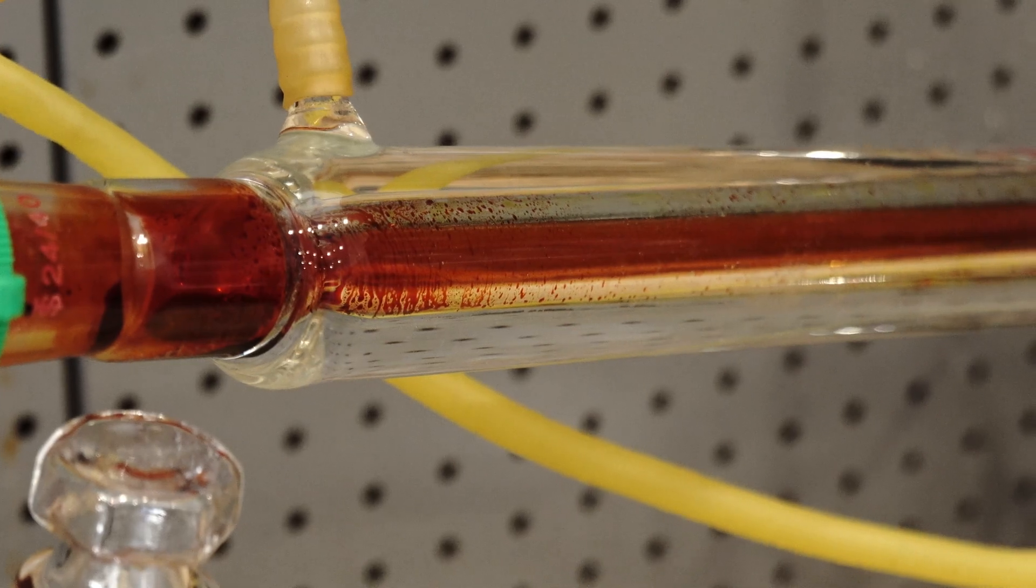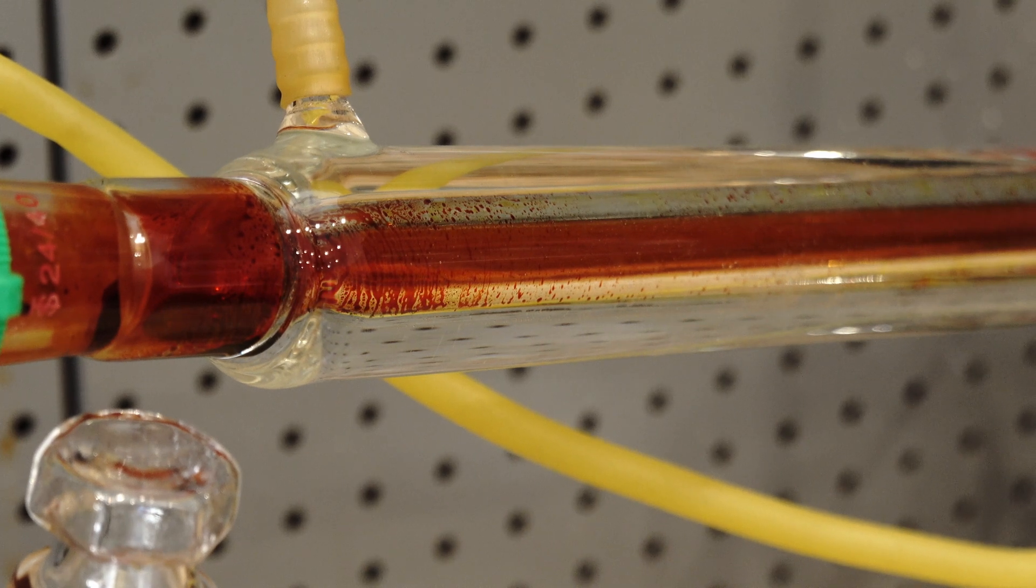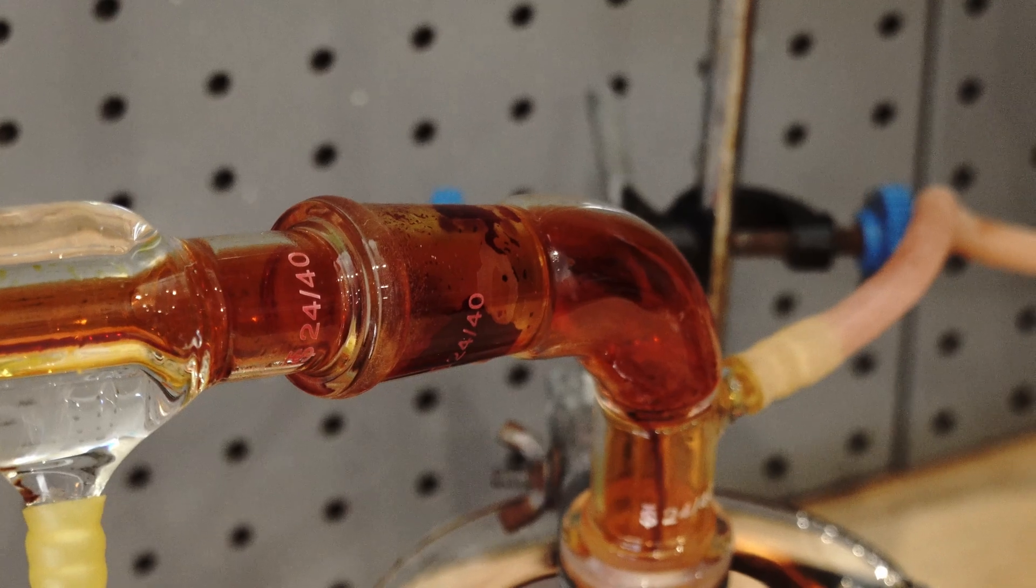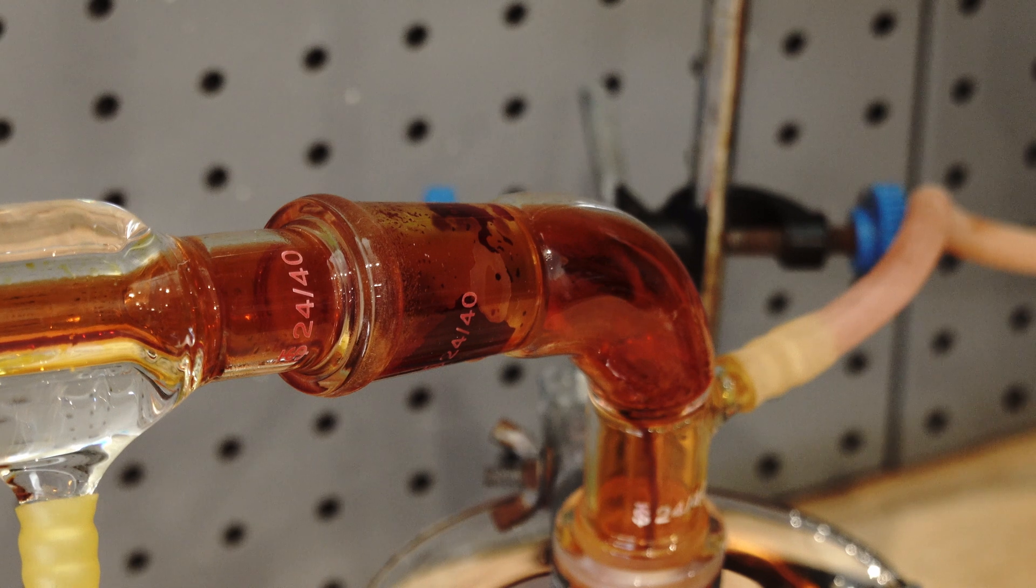And here's a shot of the condensing tube, recondensing the Bromine vapours. Eventually, over time the Bromine started to go into the collection flask, drop by drop.